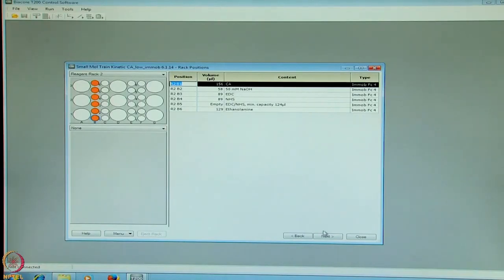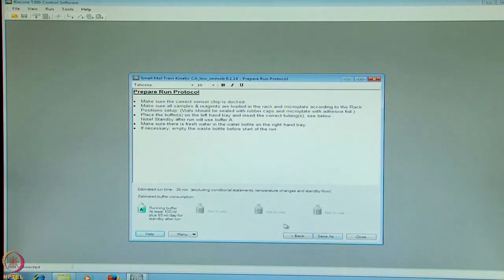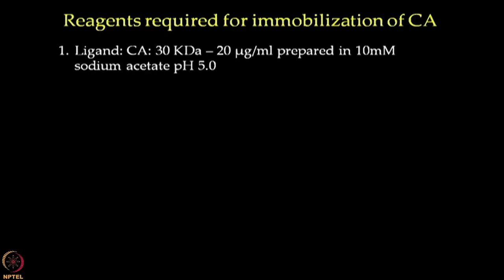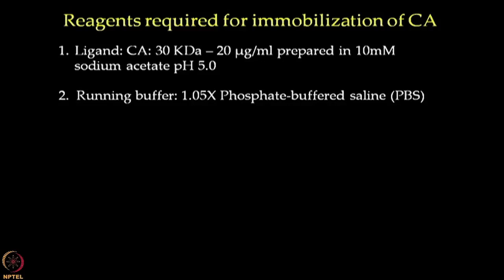Once the template is prepared, we go on to the next tab and we identify the run time of 36 minutes with a buffer consumption of at least 100 ml for this particular session. As per the volume listed on the table, we will prepare the buffers and reagents required for immobilization of carbonic anhydrase on the sensor chip. The ligand is prepared at a working concentration of 20 microgram per ml using an immobilization buffer of 10 millimolar sodium acetate pH 5. We will be using 1.05x PBS buffer as the running buffer which will be connected to the system followed by priming.